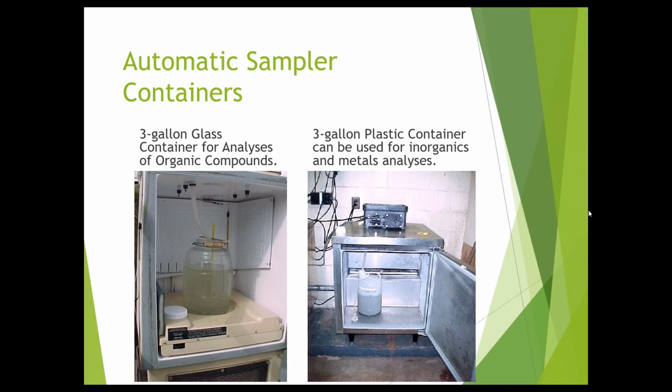So I have another question for you. Does the preservative time start once the composite sample is completed, or at the start of the compositing process? So that's the same question as the last. Be consistent. That's the driver. Be consistent.